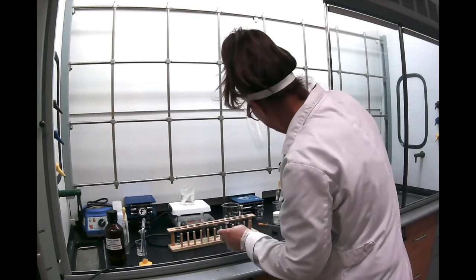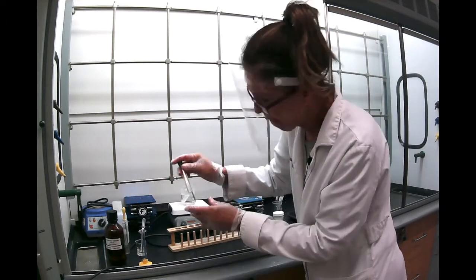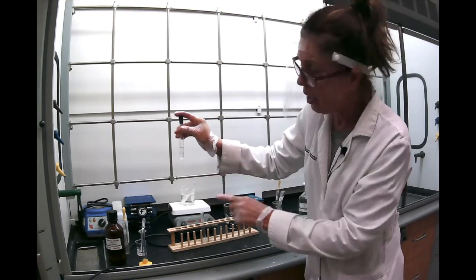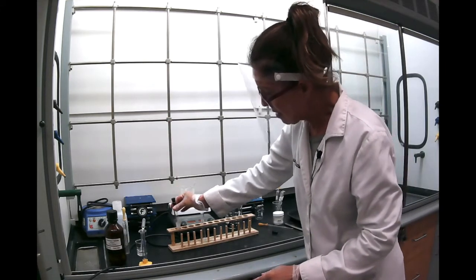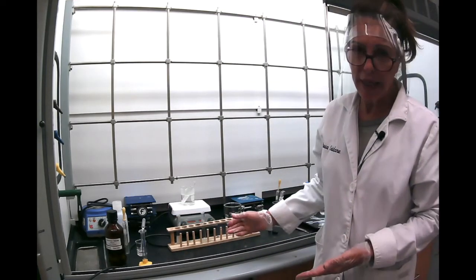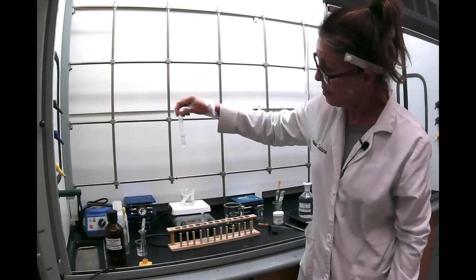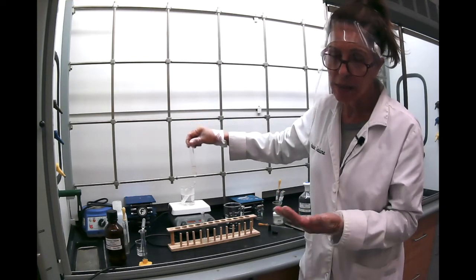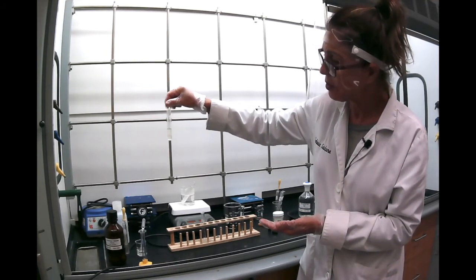Now the next step is you put a stopper, and you can see already there's no more benzoic acid. It's all gone. I can still shake it a little bit and let it sit. So this is basically what we call an active, chemically active extraction. What happened to the benzoic acid is it definitely reacted with the sodium hydroxide. Since it's an acid and you put sodium hydroxide, which is a base, you're going to have an acid-base reaction right here.